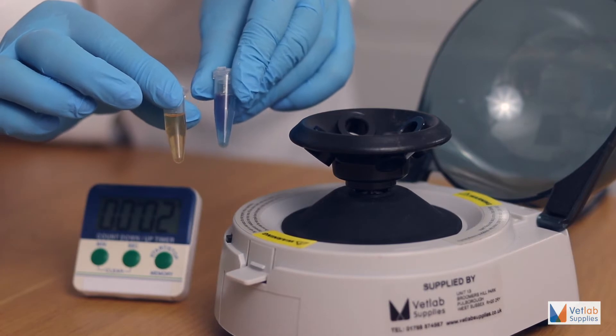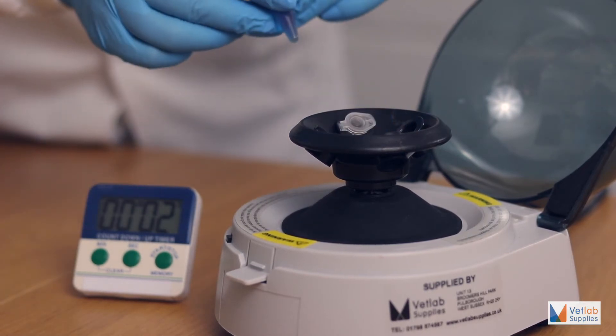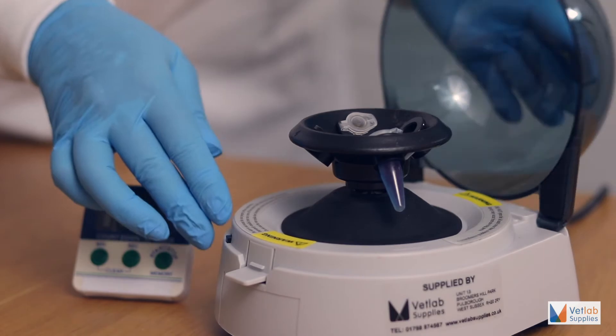Simply load and balance your tubes correctly, close the lid, set your timer and switch on.